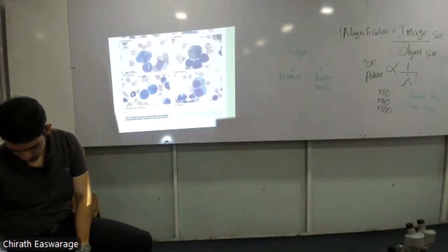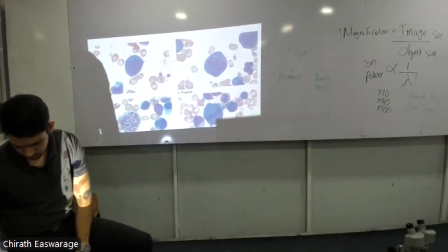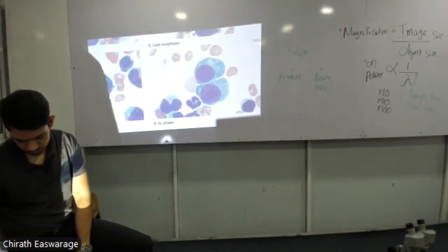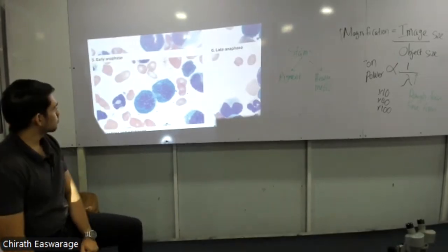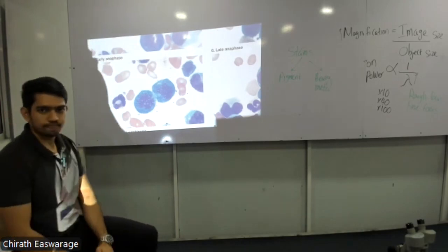These are all high power images of cells dividing, right? So this is before a cell is dividing. We'll talk about the cell cycle. At the end, what do you have? We have two cells. Nice, right? We have two nice cells. You can see these under a light microscope, high power, maybe 1000 magnification.